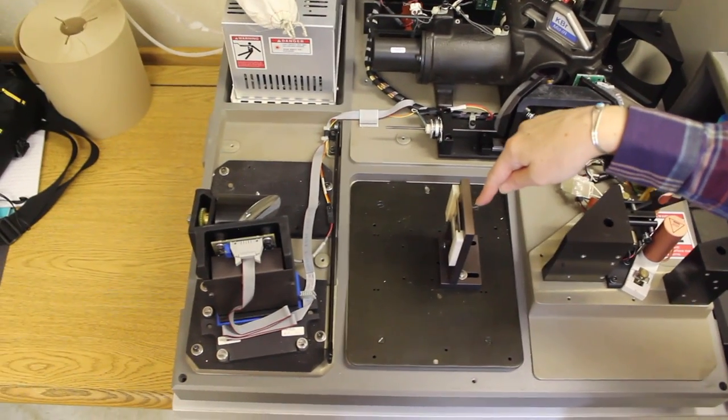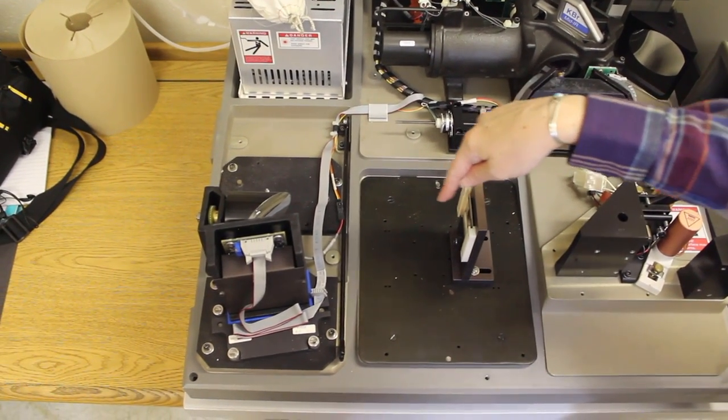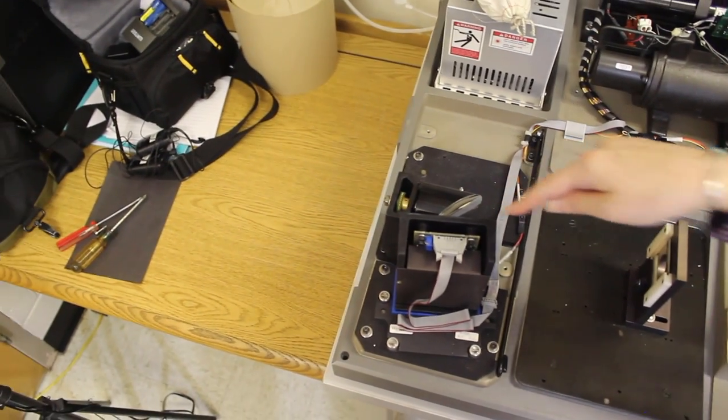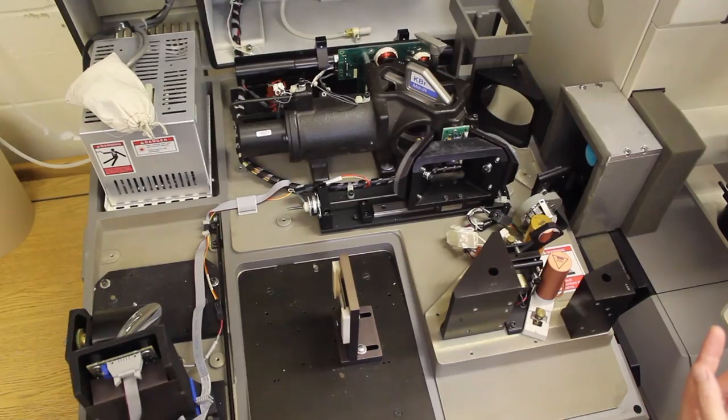In the main spectrometer, the light bounces off another mirror, goes through the sample, and into the detector.